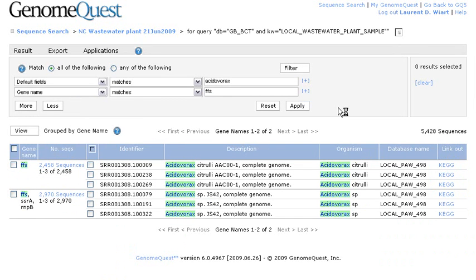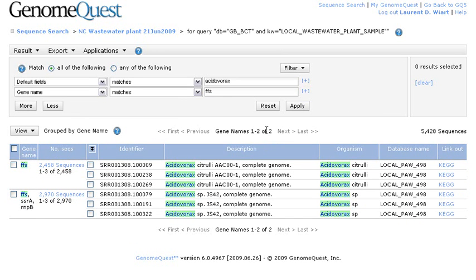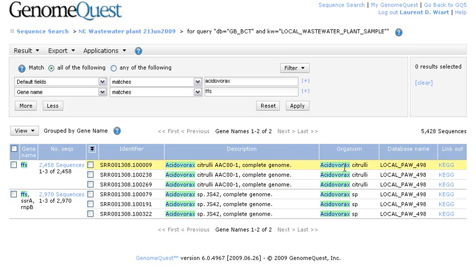So now, GenomeQuest is showing the reads that are annotating this FFS gene name. And now, we have a total of more than 5,000 reads annotated by this gene. Some from acidovorax citrulli. Some from this other strain.